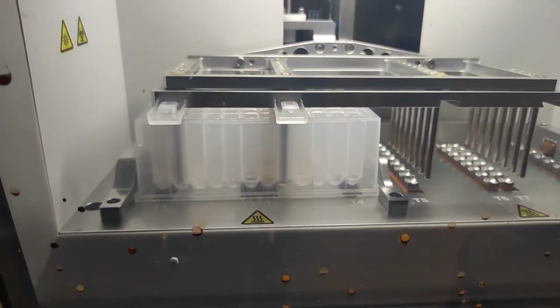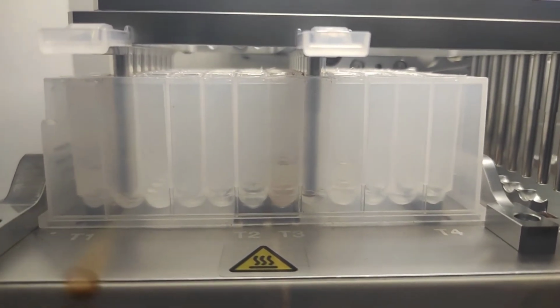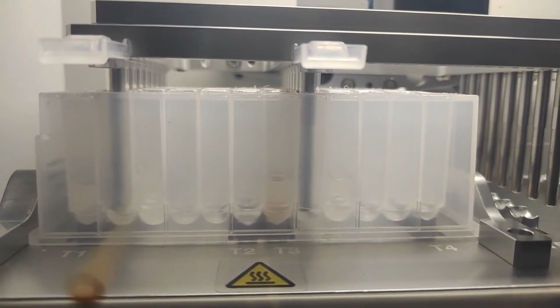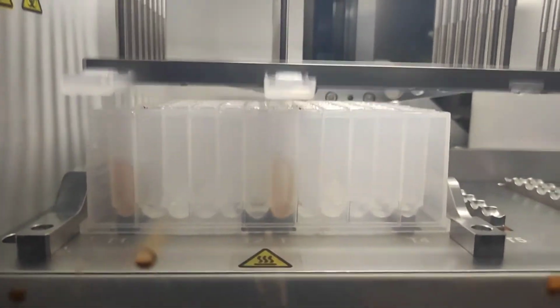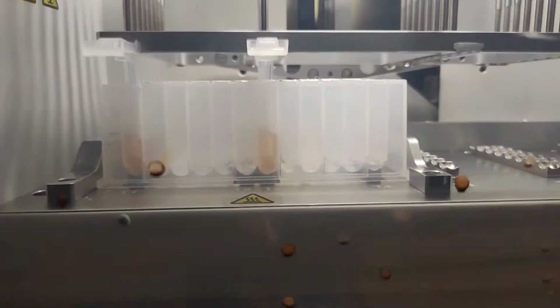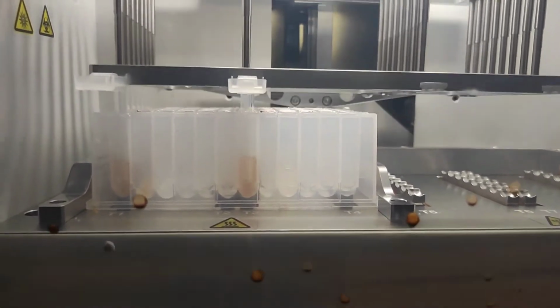The magnetic beads are getting attracted to the comb. First of all, the magnetic beads will get attracted to the comb, and now they are transferred to the first well of the plate for the next step, that is lysis. It will take 5 minutes to complete the lysis process.